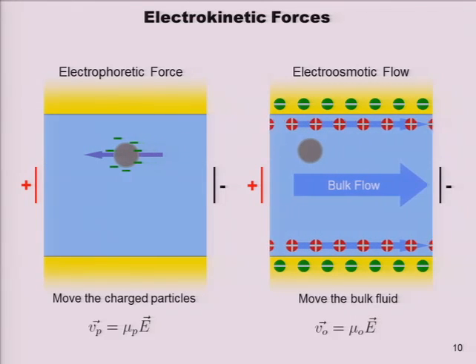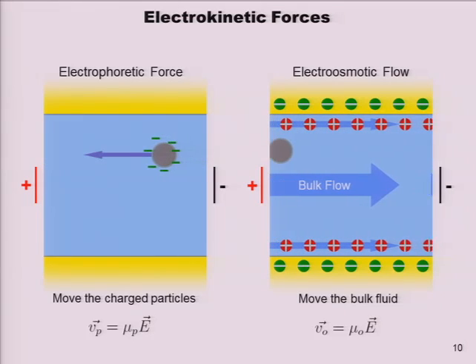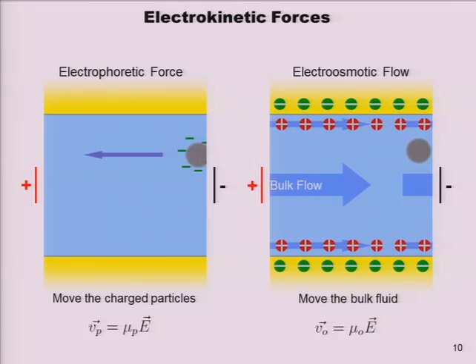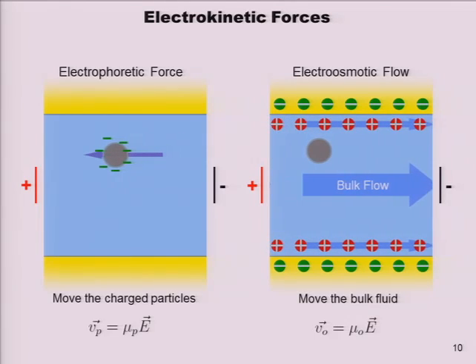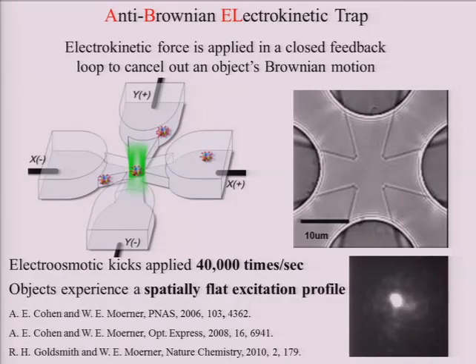And because we're in some solution of finite viscosity, that solution is going to drag anything with it, including any neutral objects in solution that we're interested in studying. So that's pretty convenient. So we can combine our rotating spot position estimation system with our electroosmotic actuation system and use it to make movies like this. These are, again, single proteins fluorescently labeled, contained at the center of this image without any immobilization for multiple seconds.